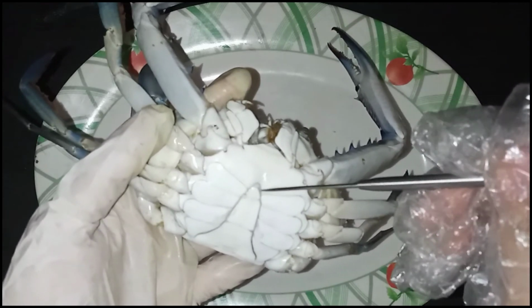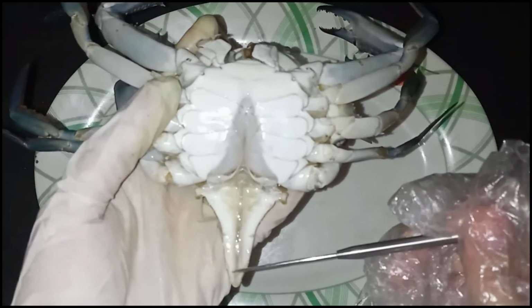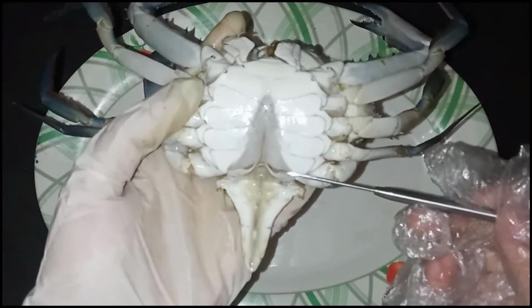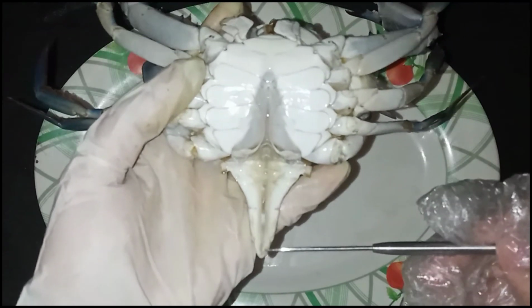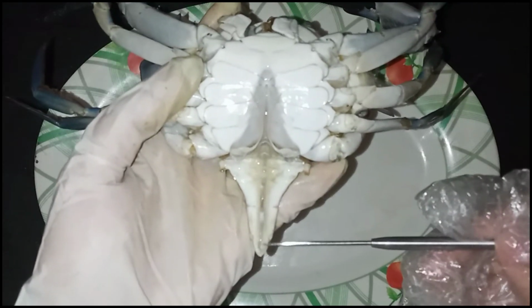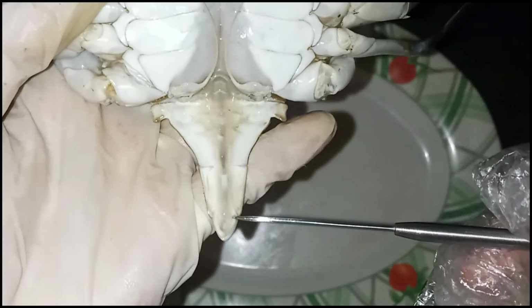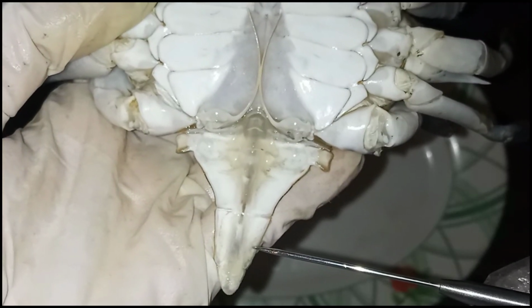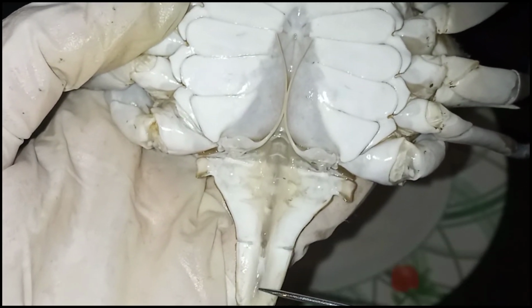This is the locking spine of the crab. So this crab is a male, and this part is called the anus. And this is the intestine of the crab.